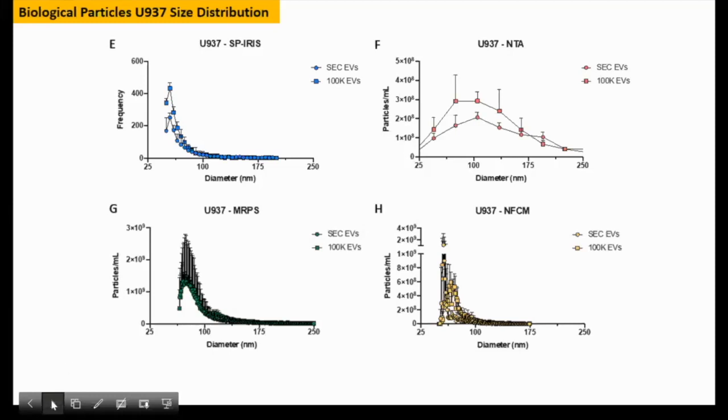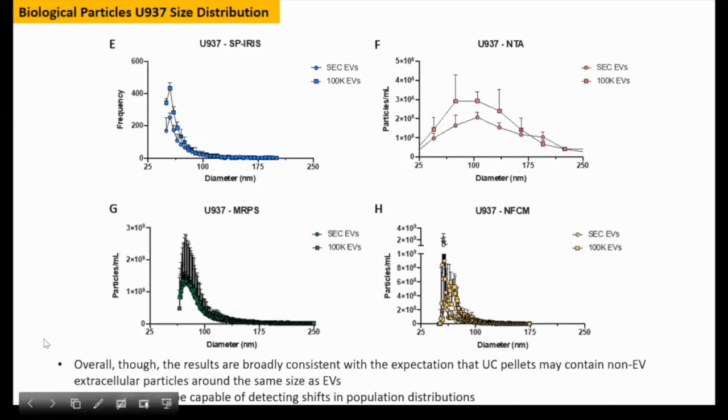Next, please. However, we would like to be careful because evidence of aggregation by UC is not apparent in the data that we are presenting here.